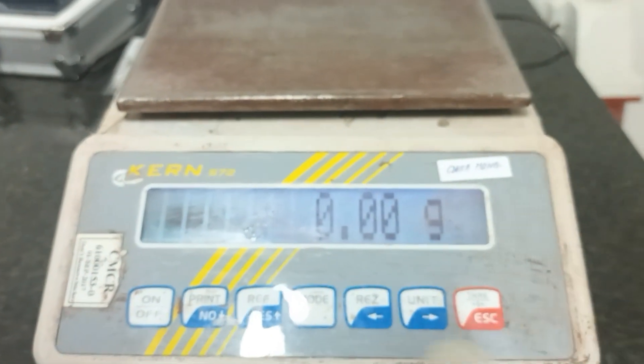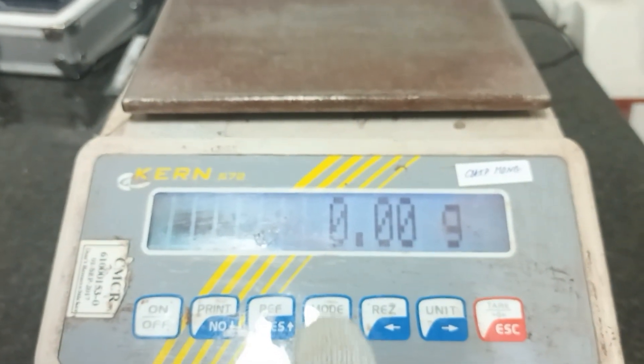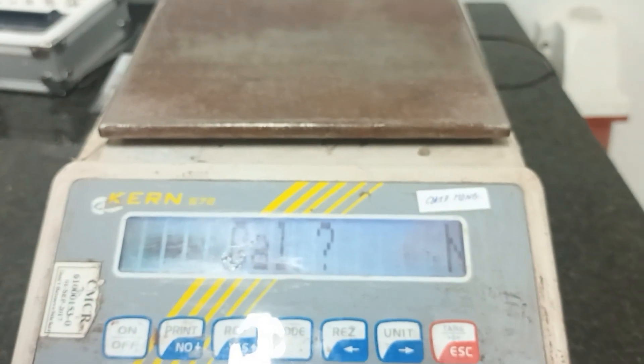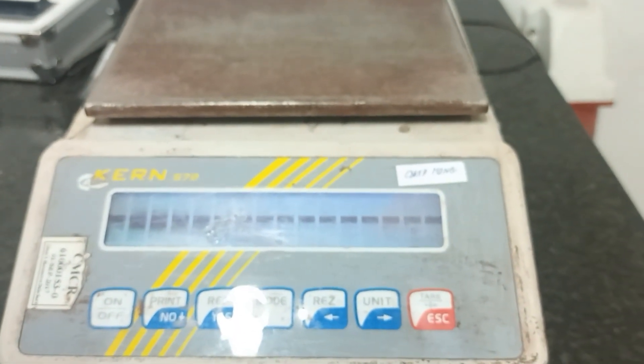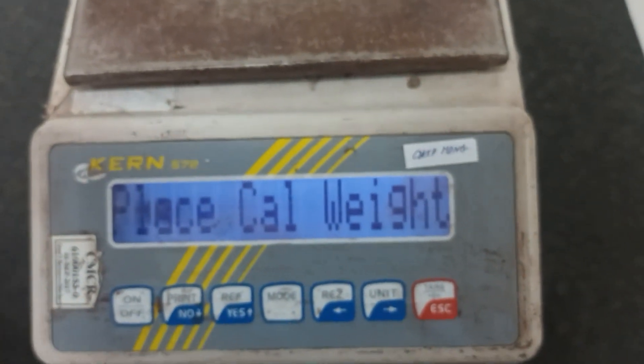I will press the mode key. The mode key shows the calibration mode. Then I will press Enter. Now, this will prompt you to place the standard weights on the pan.